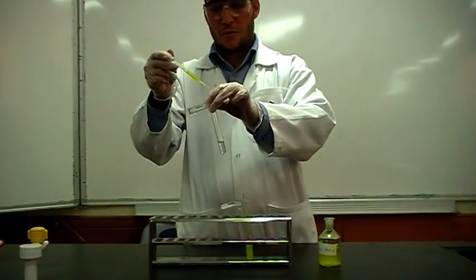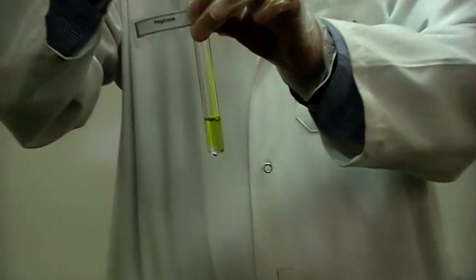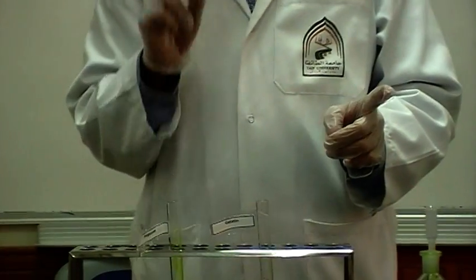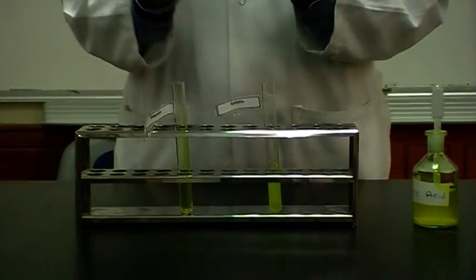Let's do it with peptone. You see, only color, yellow color. Simply, if you have gelatin and peptone and you would like to differentiate between them, use Picric Acid.